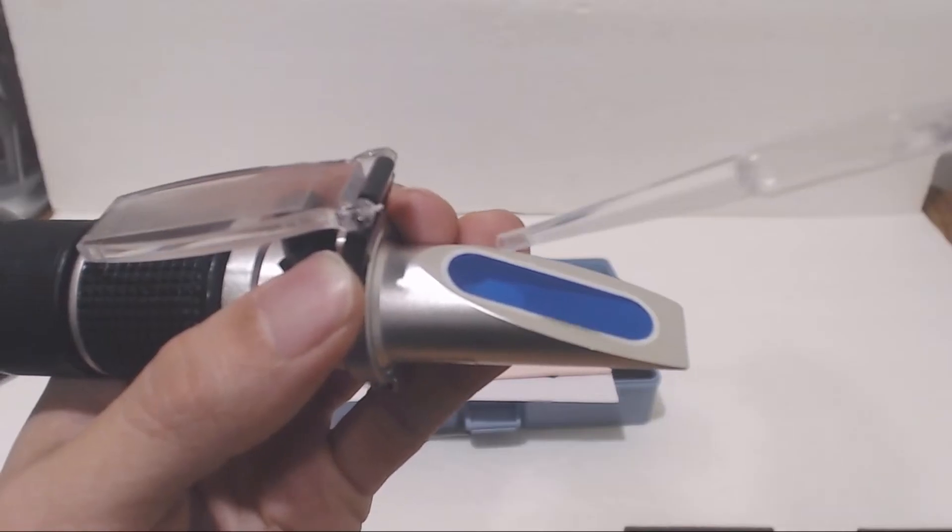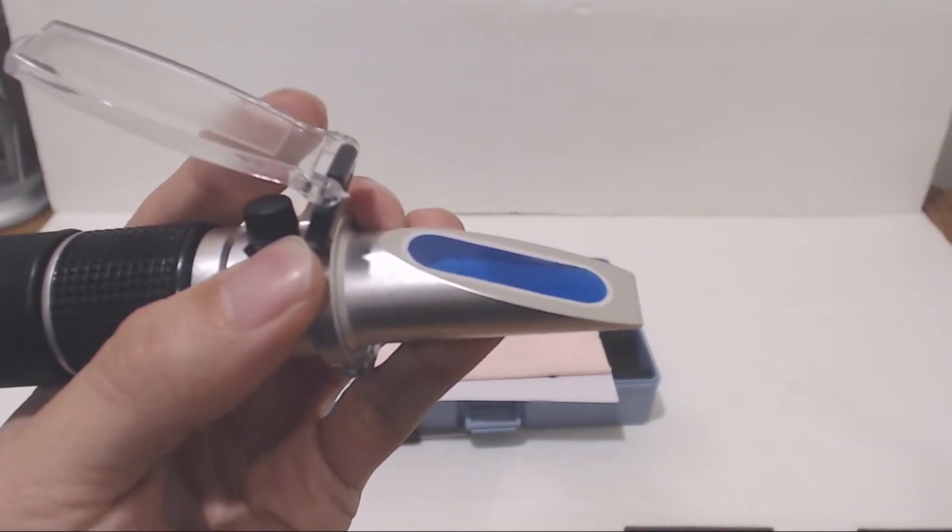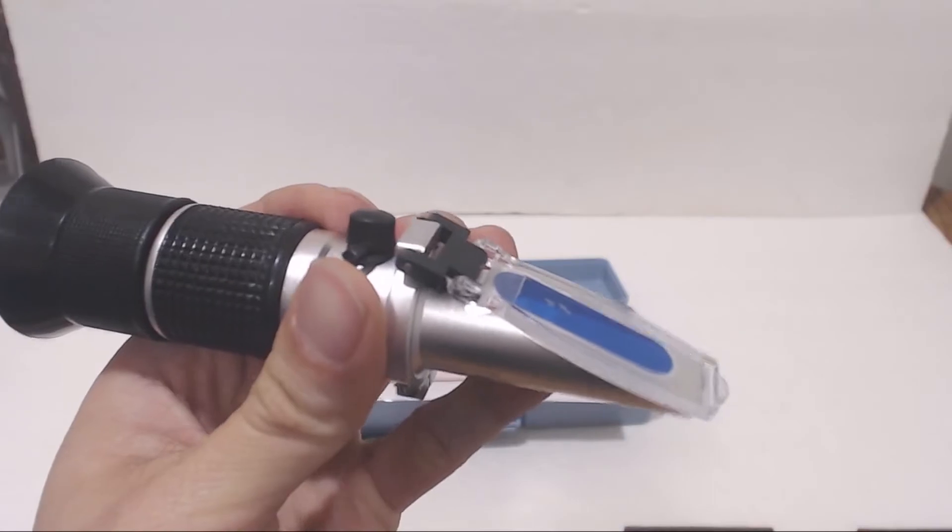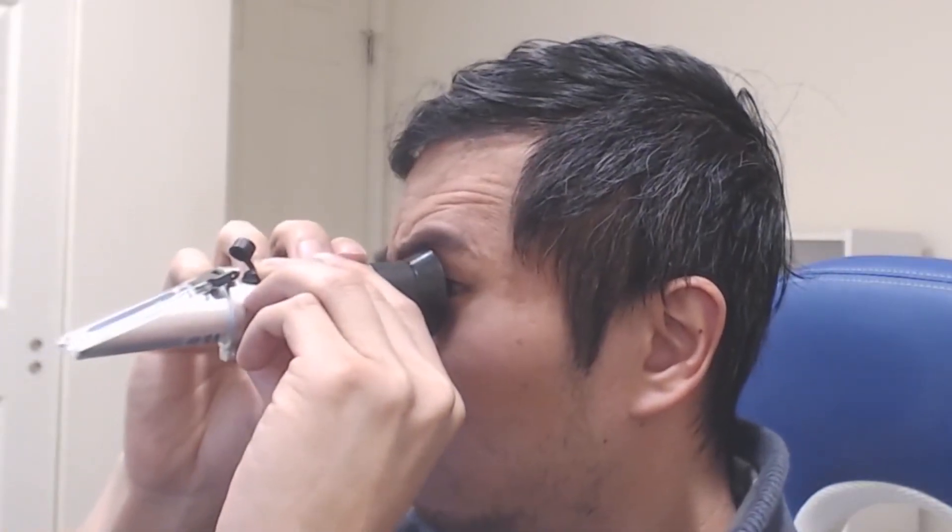To use the refractometer, place a couple of drops of the sample directly onto the prism, then close the plate to flatten the sample out and remove any air bubbles. Hold the prism end up to the light and look into the eyepiece. If the scale looks blurry, rotate the eye cup to focus until you can read the scale.